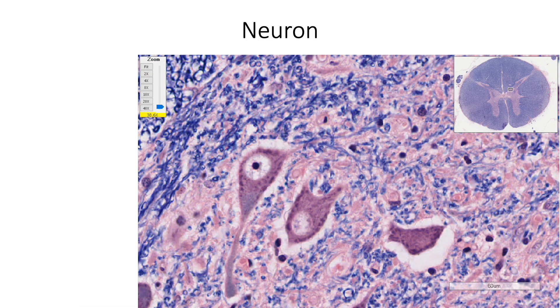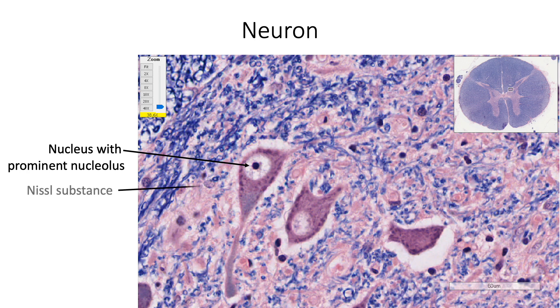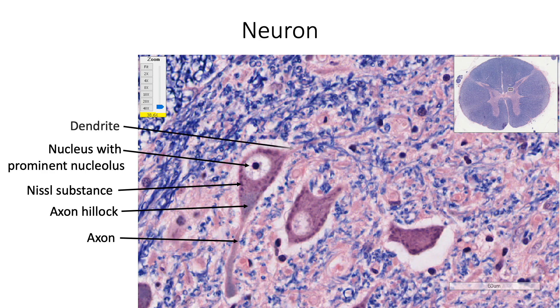Here we are seeing a cell body or perikaryon of a neuron showing a vesicular nucleus with a prominent nucleolus. The cytoplasm is showing prominent Nissl substance made of rough endoplasmic reticulum. The axon hillock with sparse Nissl granules marks the site of beginning of the axon. You are also able to see a dendritic process at the opposite pole of the neuron.